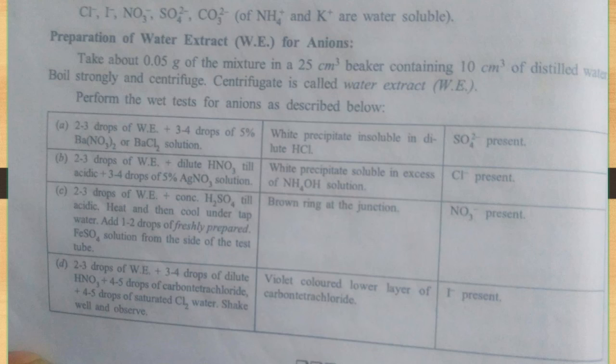Now remember one thing here, my dear students, whenever a major component is provided to you, which you have already analyzed in quantitative analysis. For example, the major component is magnesium sulfate. That means sulfate ion is already present along with magnesium ions, and therefore you will get the test for sulfate ions in the wet test.